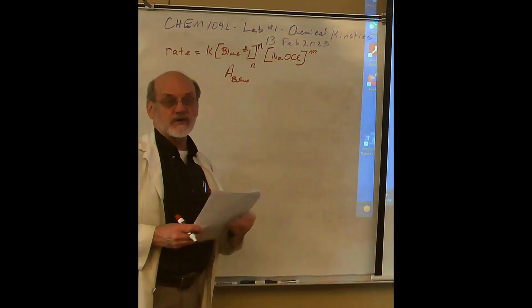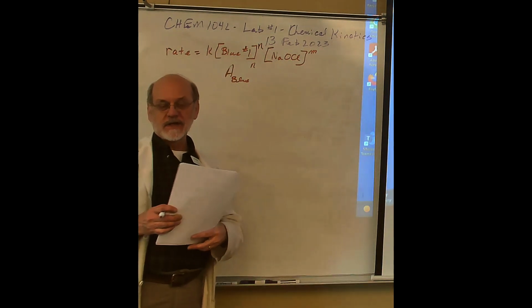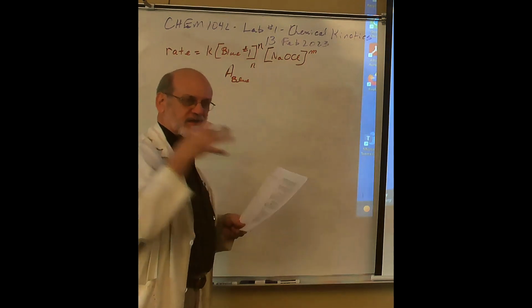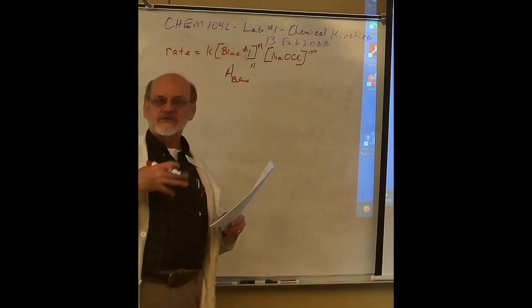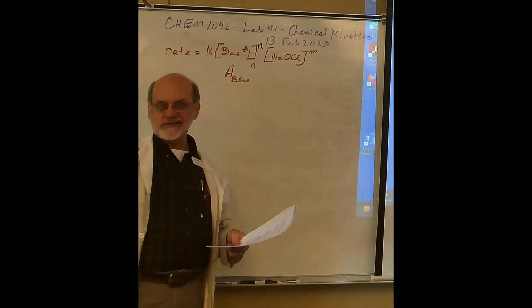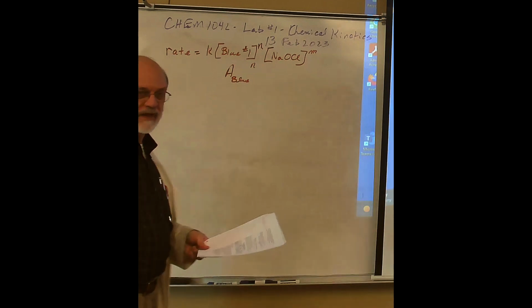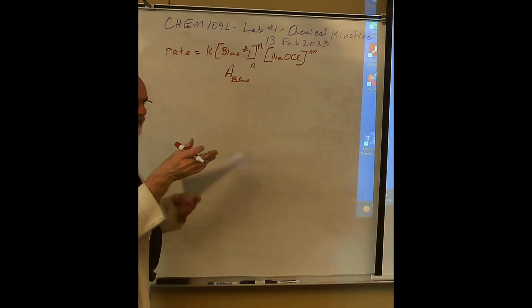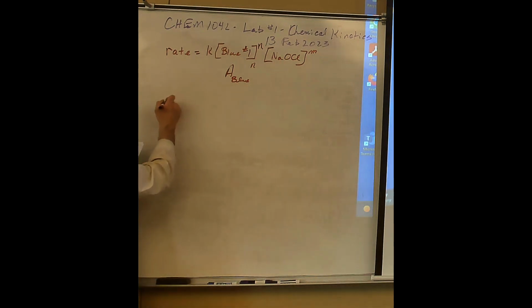The absorbance units are a logarithmic scale, and actually building the logarithmic scale into the machine straightens out the curve and makes it linear. Transmittance we don't want. So we use absorbance. Beer and Lambert were two people that contributed to this.